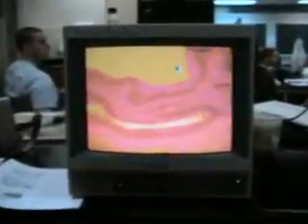So the tonsils can be recognized most easily based on the surface epithelium that covers them, and also some other structures. So we look at the palatine tonsil. Did you ever look at somebody who had tonsillitis, and the doctors recognize it by these little white spots on the surface of the palatine tonsil?